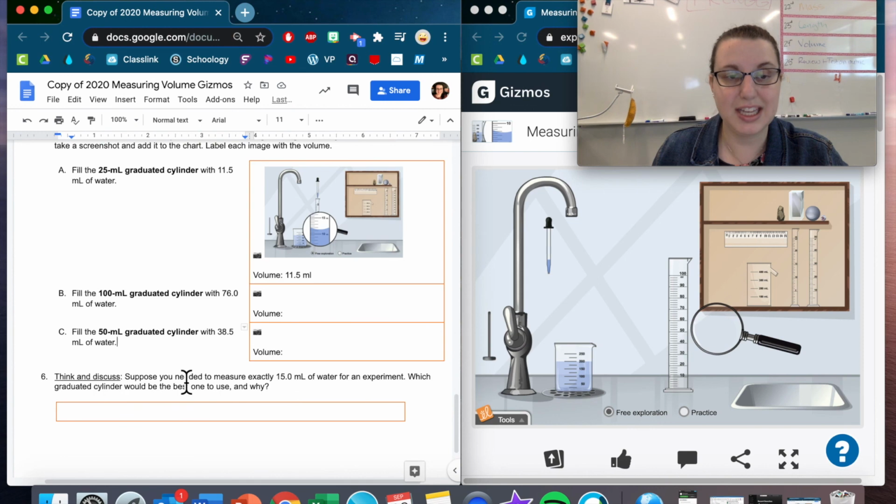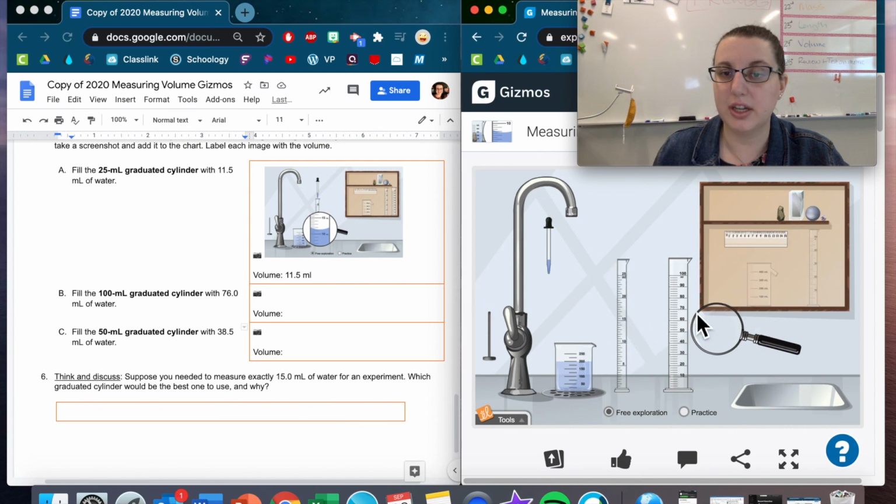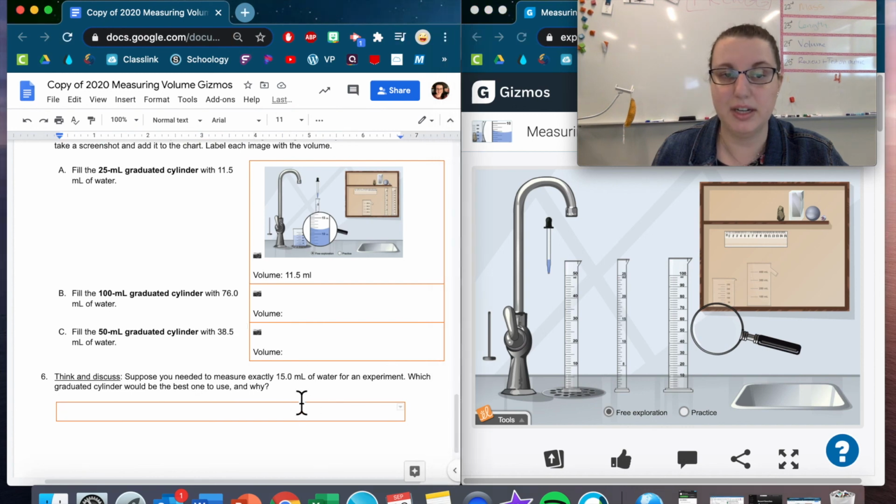And then lastly, think and discuss. Suppose you need to measure exactly 15.0 milliliters of water for an experiment. Which graduated cylinder would be the best one to use and why? So then you're gonna take a look at all three of your graduated cylinders. Put that one back so I have another room. And see which one would be easiest to get exactly 15. So you're gonna take a look at all three, and based on what you did here, figure out which would be easier to get exactly 15 and type it right there.